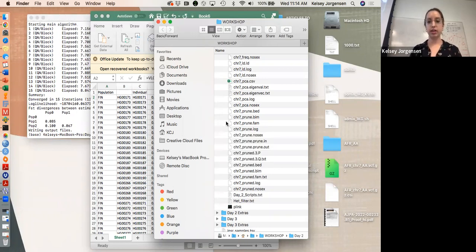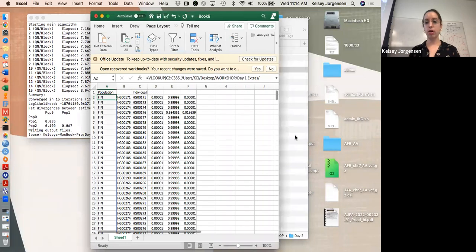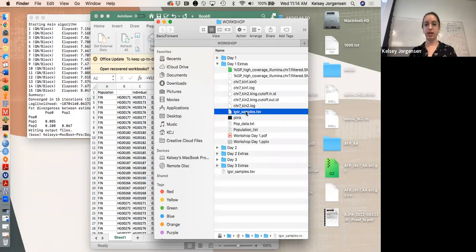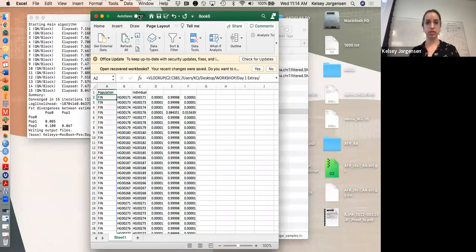Asha, do you mean this one or the PCA one or the one we just downloaded from 1,000 Genomes? This one.